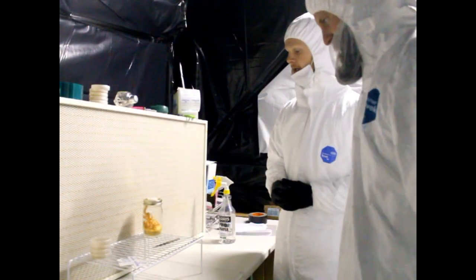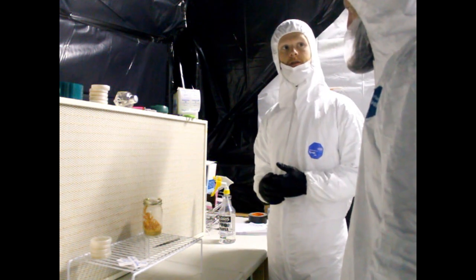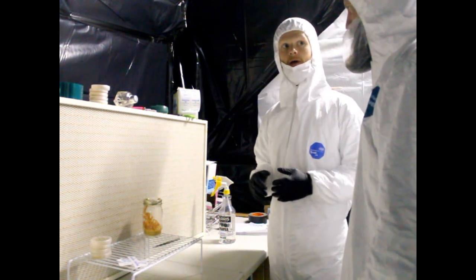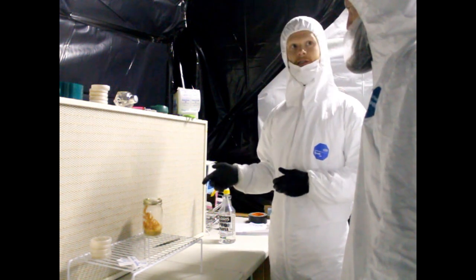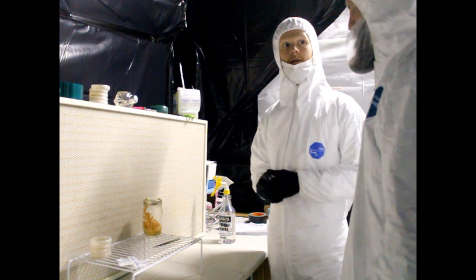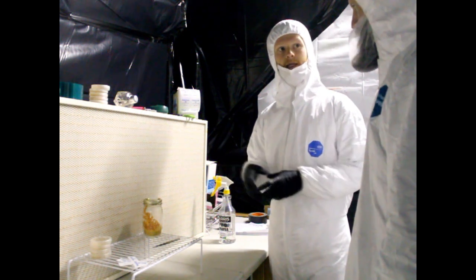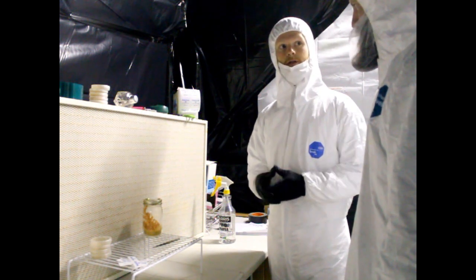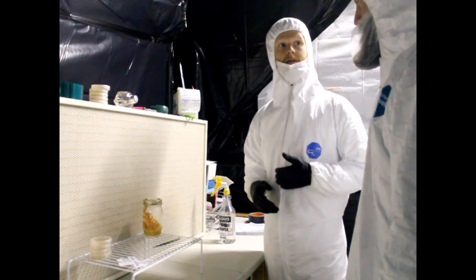We partner with a lot of foragers who go out in the wild around the United States, typically on the East Coast, and they find Cordyceps militaris in the wild growing on moth larvae in the Lepidoptera family. They'll clone it in the lab, get the DNA culture on a petri plate, and send it to us to grow out.